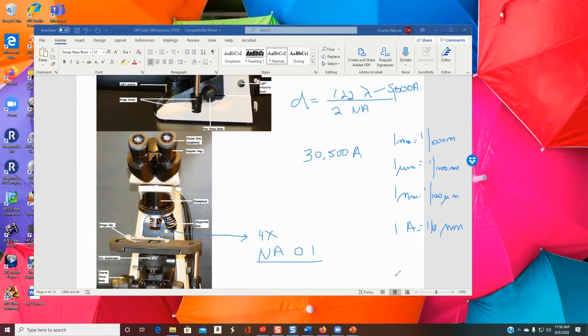So the next question is, a couple questions for those of you out there. How many decimal places are there between here and here? Actually, only one, because this is 1/10 of this. Good try, though. How many decimal places from here to here? That answer would be 3, because this is 1/1000th of this.